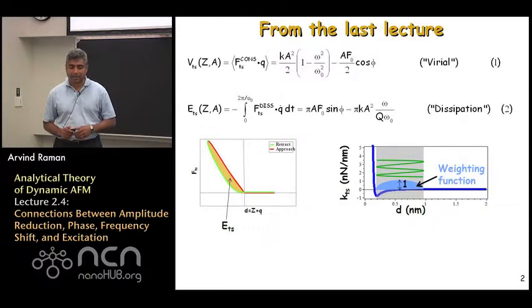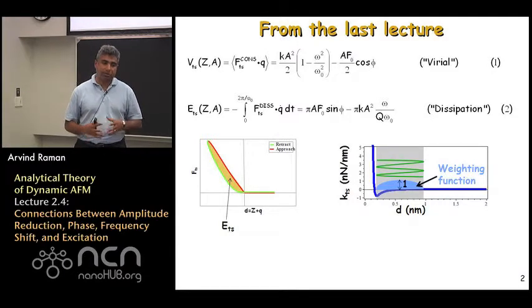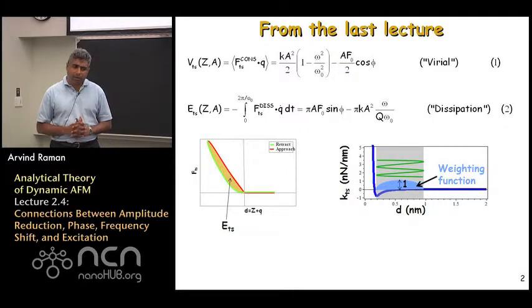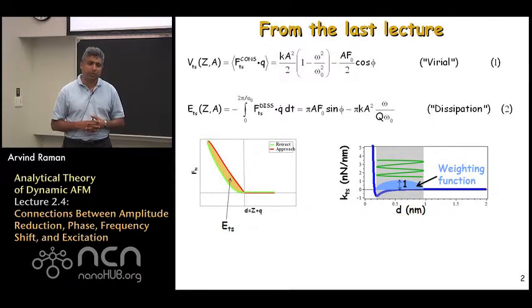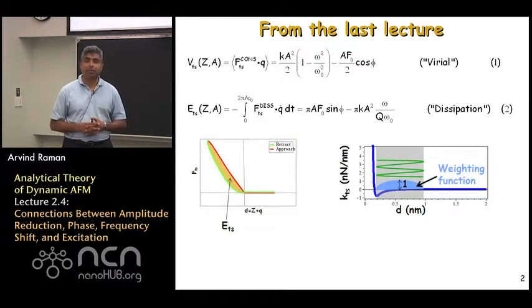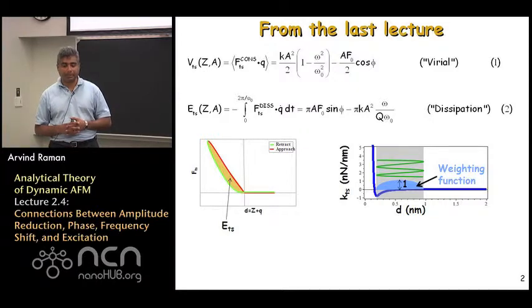The last time in class we had talked about the analytical theory, the analytical basis for dynamic atomic force microscopy under conditions where the tip amplitude cannot be considered infinitesimal with respect to the tip sample gap, which required a very different approach, a mathematical approach to understand the basic physics of image formation and material contrast in all dynamic AFM modes, whether they be tapping mode, AM-AFM or frequency modulated AFM.